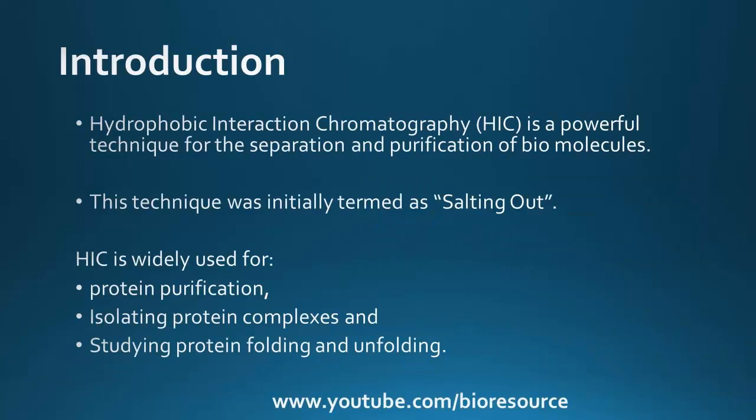Hydrophobic interaction chromatography, or HIC, is a powerful technique for the separation and purification of biomolecules. This technique was initially termed salting out, and it is widely used for protein purification, for isolating protein complexes, and also for studying protein folding and unfolding.